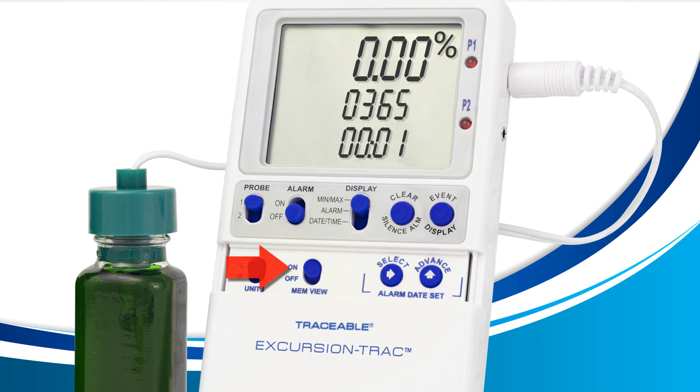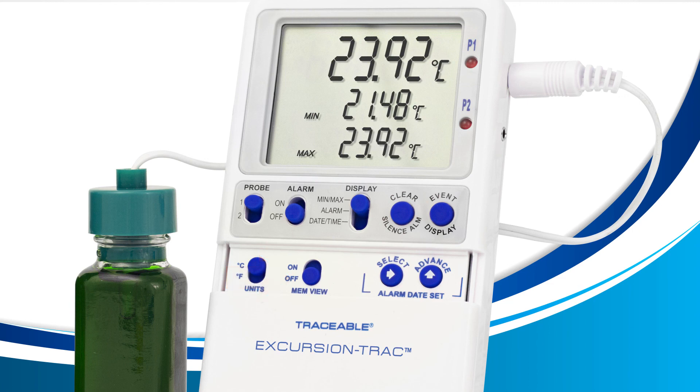Once you're done, set the MIM view switch back to off. Now continue normal operation.